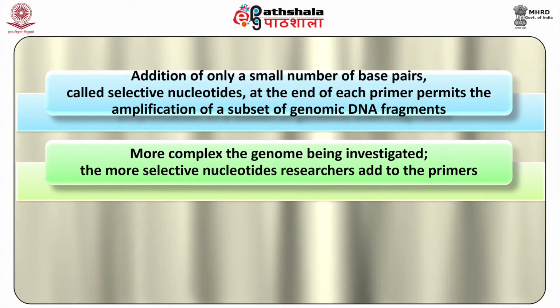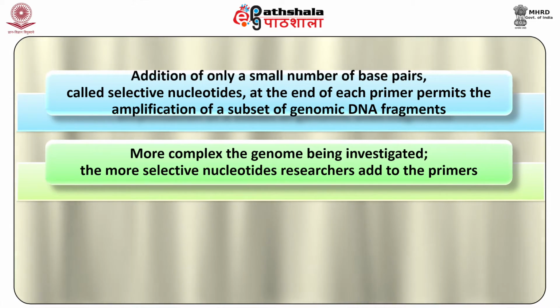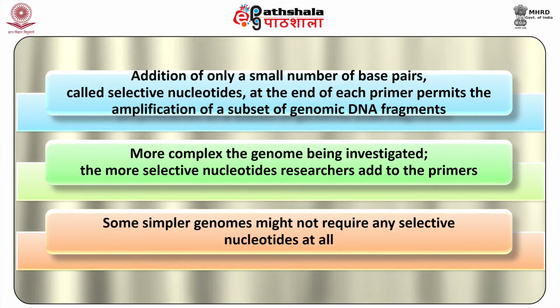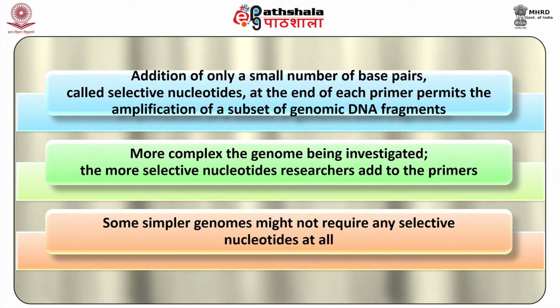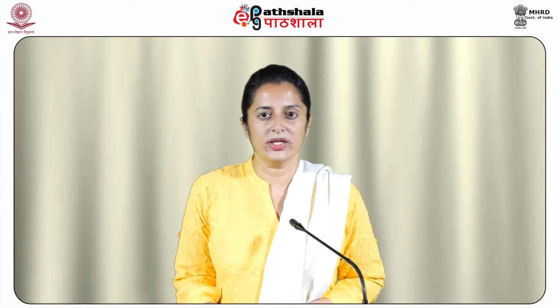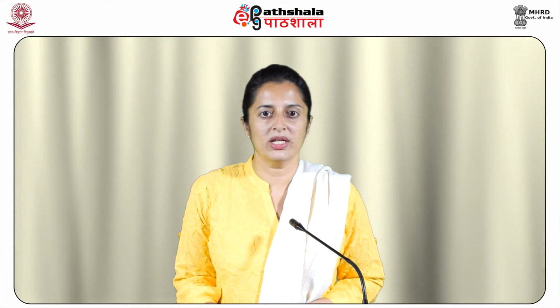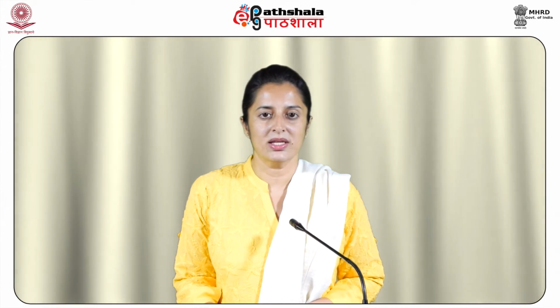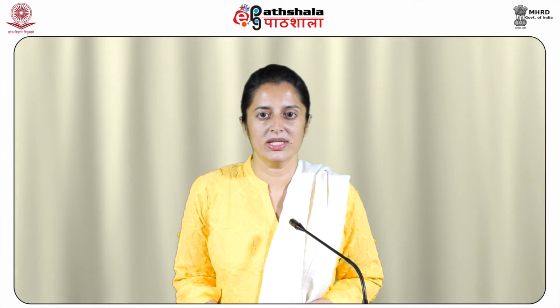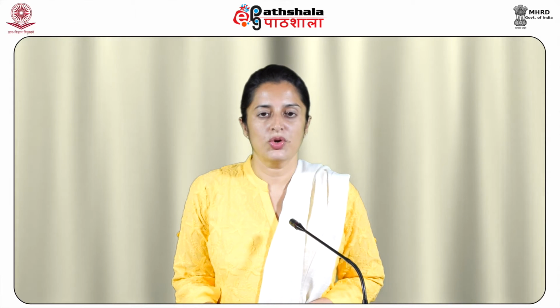The more complex the genome being investigated, the more selective nucleotides researchers add to the primers. Some simpler genomes might not require any selective nucleotides at all. As the number of nucleotides added to the 3' end of each primer is increased, the selectivity of the primer also increases. After all, more genomic DNA fragments will be amplified by a primer that contains a single unique base at its 3' end compared to a primer that contains 3 unique bases at its 3' end. The primer design does not require any previous knowledge of the genome under study.